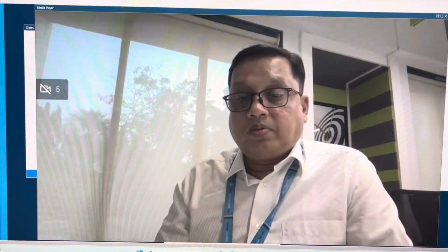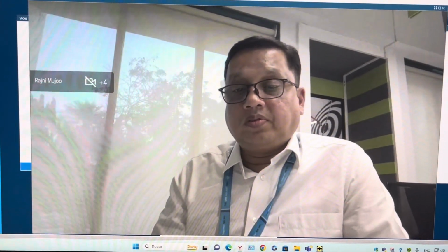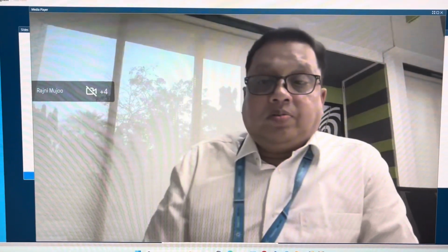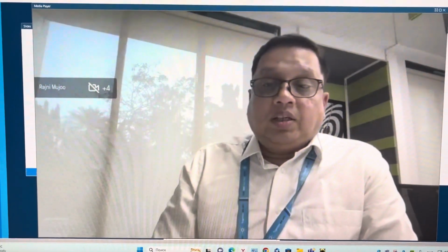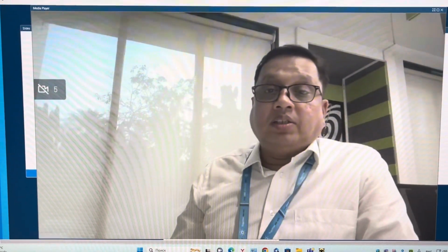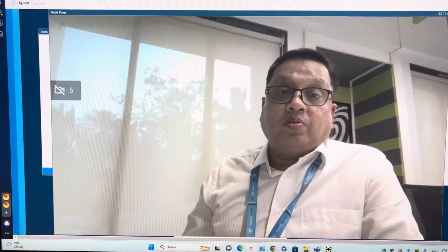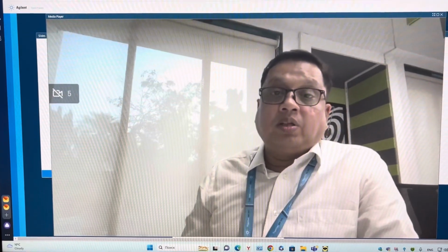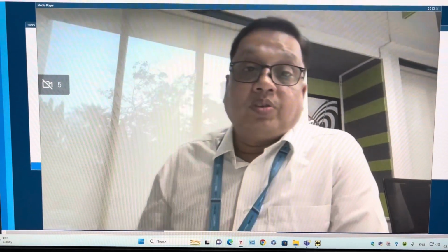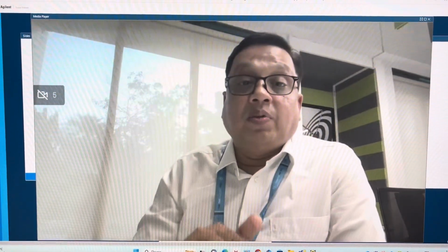Okay, thank you, Sunil. One more question is, why is acetone used for the gradient step test in HPLC calibration? Yeah, I also did the calibration during the days when I was working in HPLC. The only reason acetone is used is its absorption of the wavelength. When the gradient is changed, because of the absorption capacity of acetone, it gives a good change with respect to your baseline, and you can see the steps very clearly.